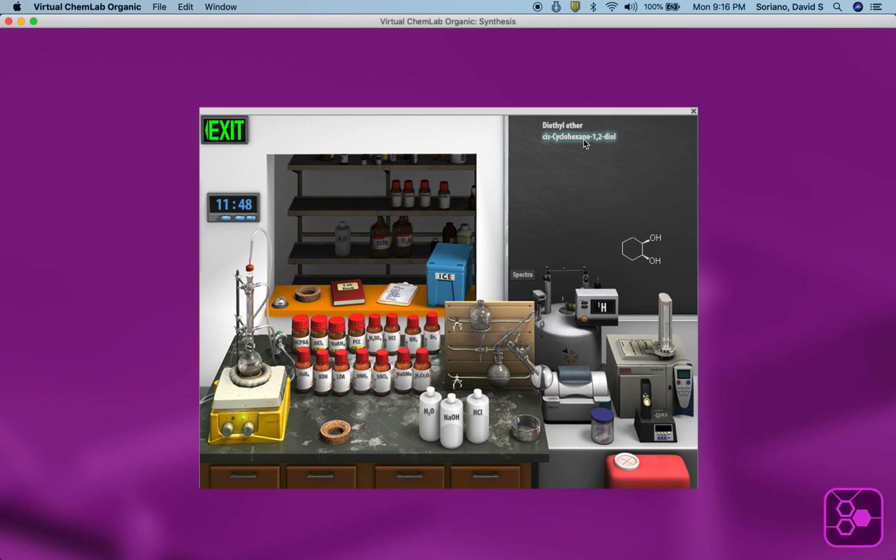You have diethyl ether and the product. Now, I would have my students look up the melting point of the product. I would always have them record both starting material physical properties: boiling point, density, etc., molar mass. And you can get some of that information from the SDBS online structural database, Japanese Analytical Society. It's an excellent database for proton, C13, mass spec, infrared, ESR, etc.